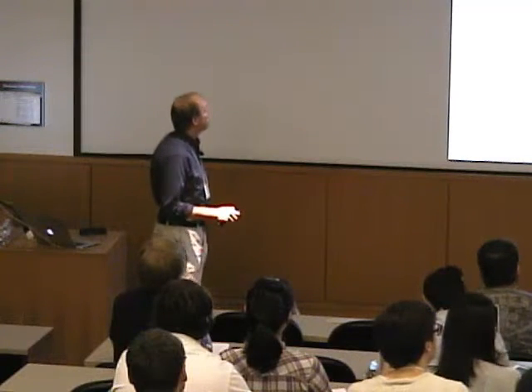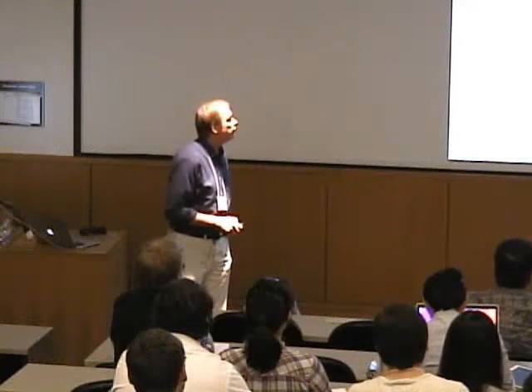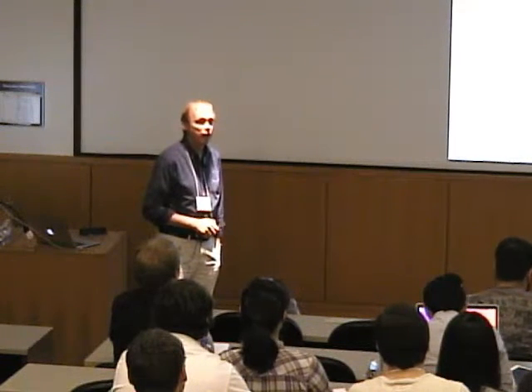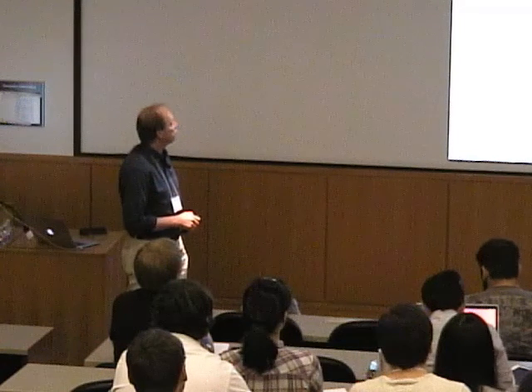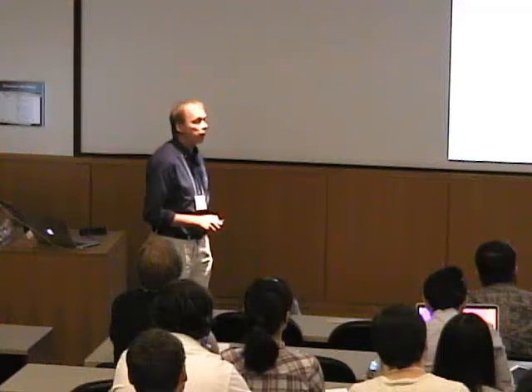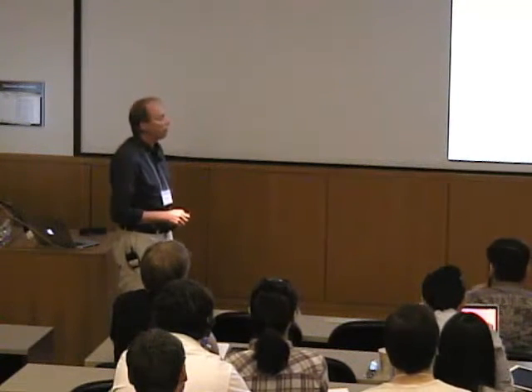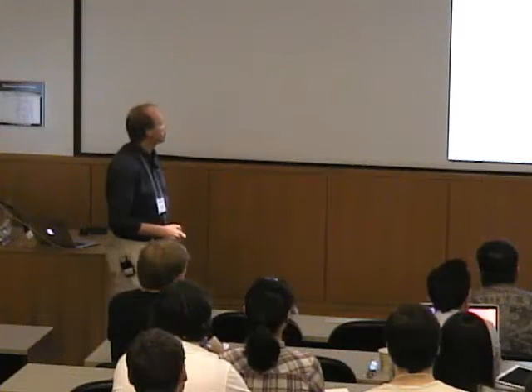And then we'll start looking at EPR in proteins at low temperature and look initially at systems with spin 1/2, because these are a little bit simpler. We'll talk a little bit about g anisotropy and what information we can get if we look at single crystals and powders, which are more common, and talk a little bit about hyperfine interaction, so the interaction between the electrons that we're observing and the surrounding nuclear spins.